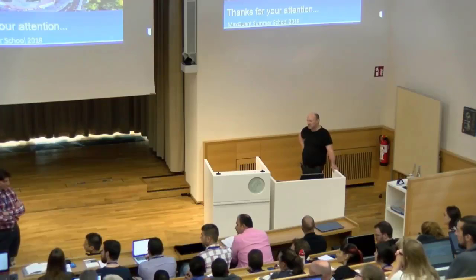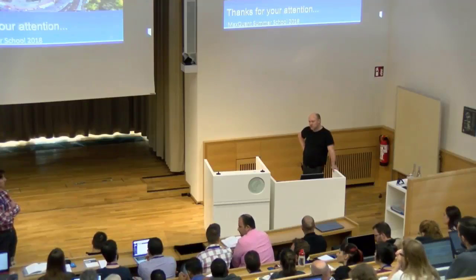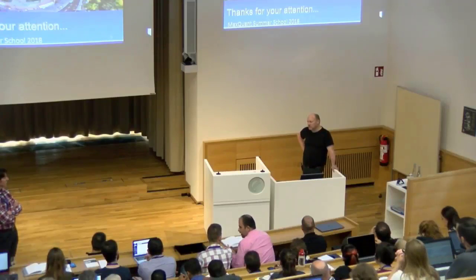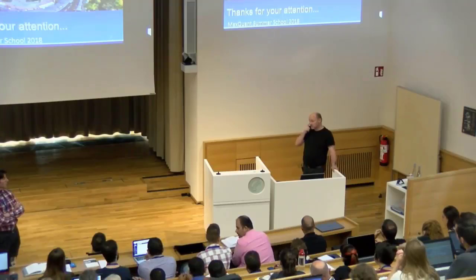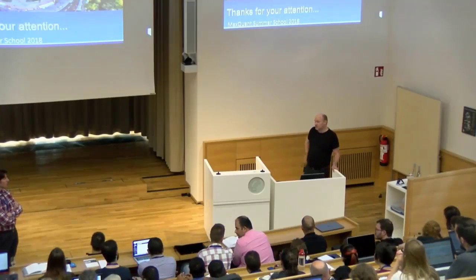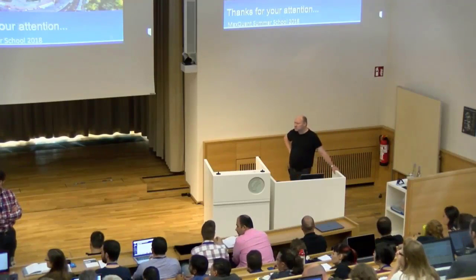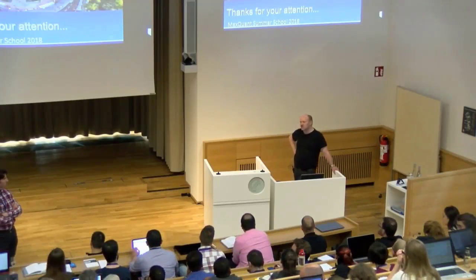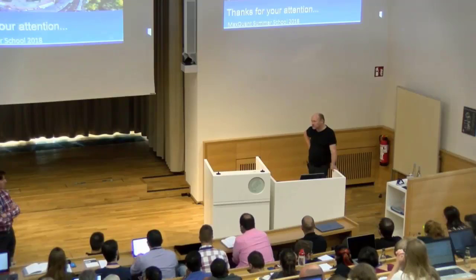So could you then just define one as, let's say, variable modification and then the other one as labeling? That should work to some extent, yes. So basically, you have to treat the SILAC labels as variable modifications, and then it would quantify all of them with TMT. And you then would probably have to do some post-processing of the output matrices to get really your desired output. But in principle, that would work. Okay, what should one pay attention to, to do it correctly when it comes to this post-processing that usually MaxQuant just does? Yeah, too many things, I guess.